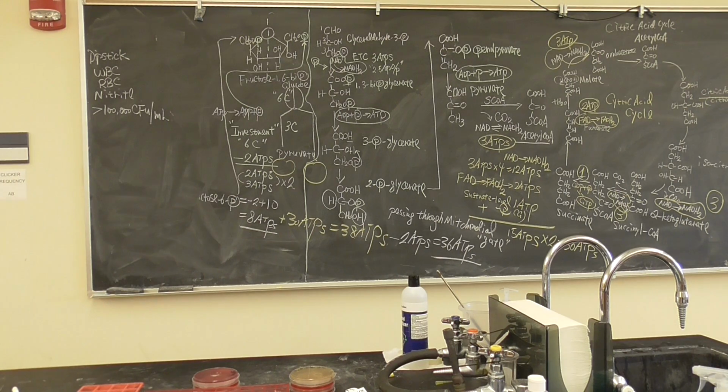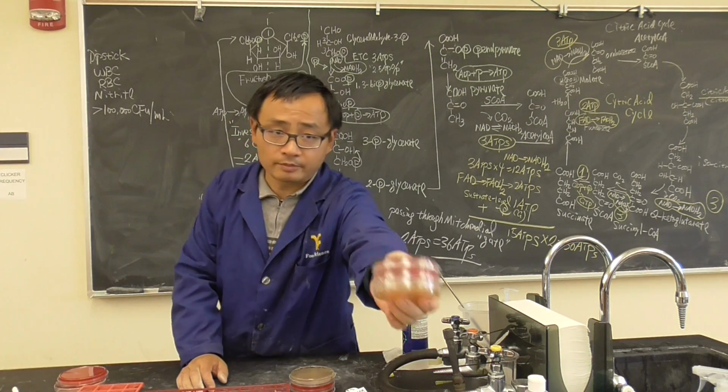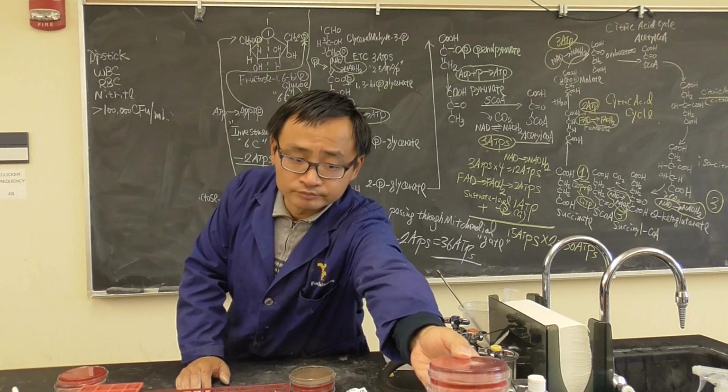Who else have a human sample? Who did the human sample right here? Okay, let me have it. We'll take a look. Is that okay? Which one is yours? This one or that one? Which one? I assume it should be something which is very clear. These, okay. We'll do some of the tests. We'll see. Okay. These plates go back to you. It looks good.